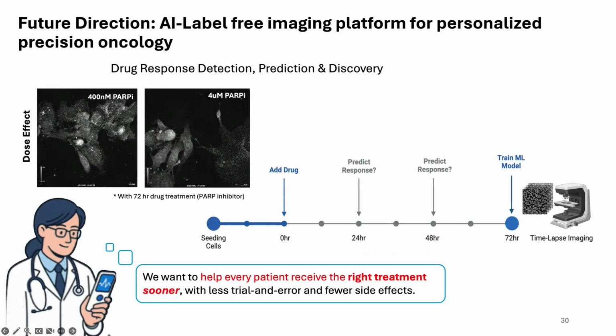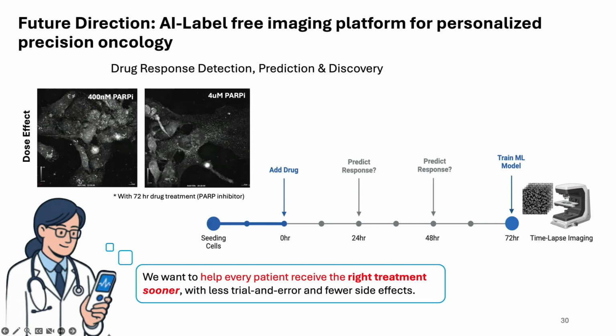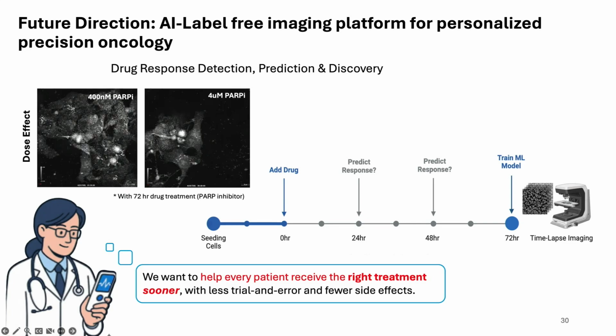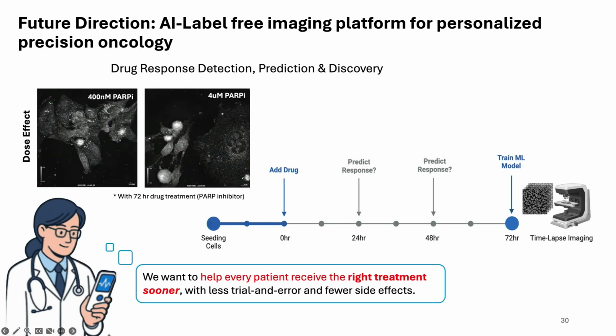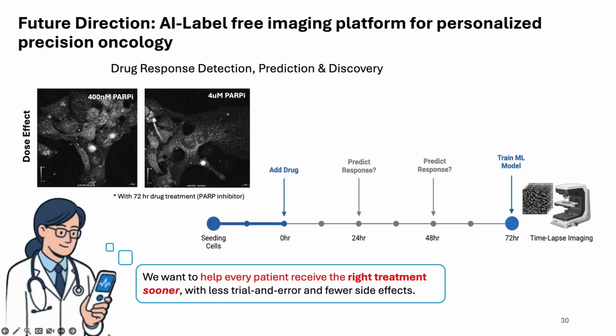Beyond real-time mutation and lesion detection, we are also developing an AI label-free imaging platform to detect and predict drug response, which could help with personalized cancer therapy and decision-making. We hope to use this platform to predict potential drug responders in a faster timeline.